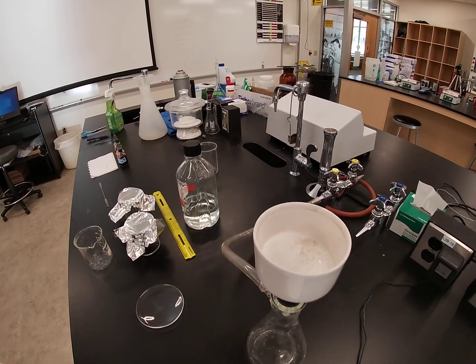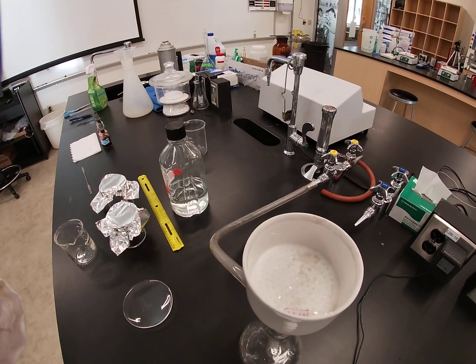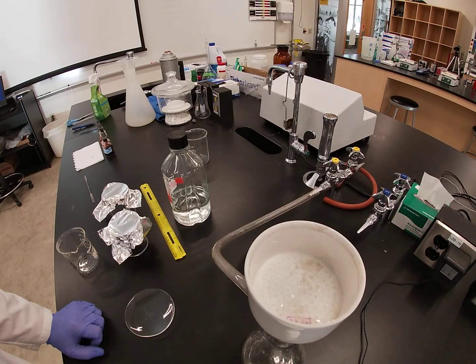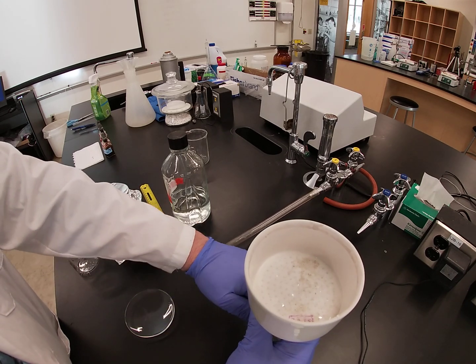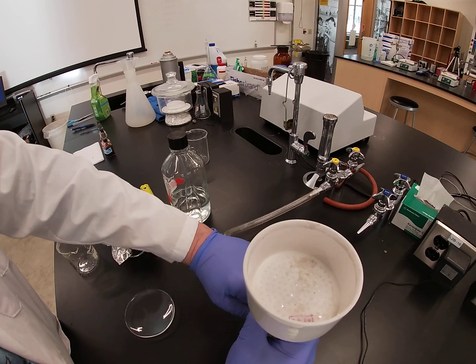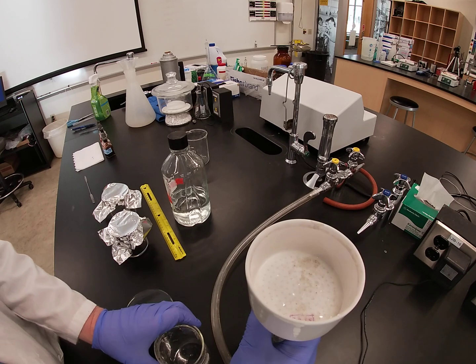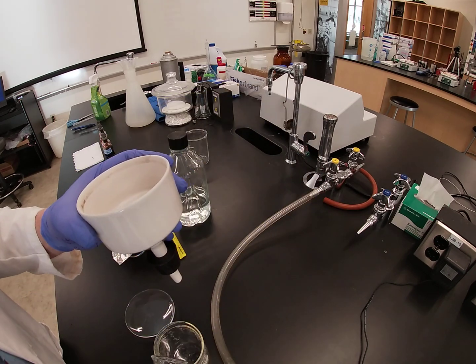If you look really closely at this, I don't know if you can see it, but there should be some sparkly looking things in there. That is the naphthalene that we did not sublime out. So that should be something that you would want to note, that we didn't get it all sublimed out. That's going to cause an error in our calculations.